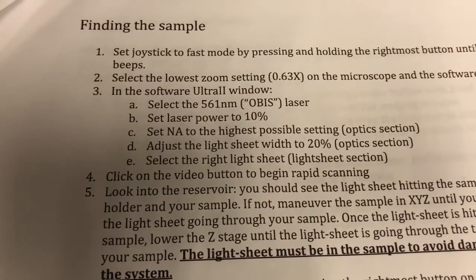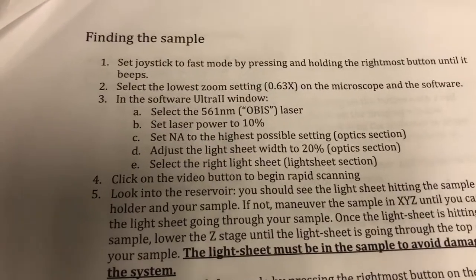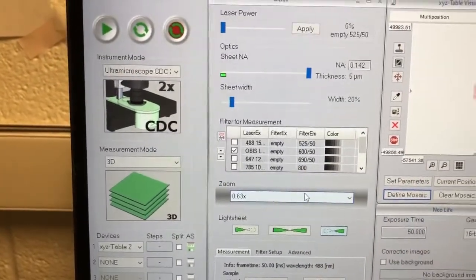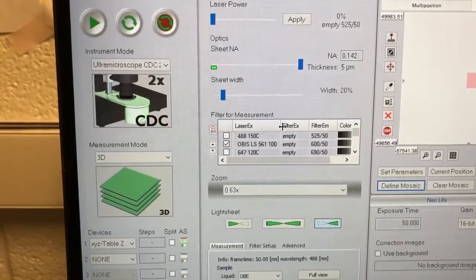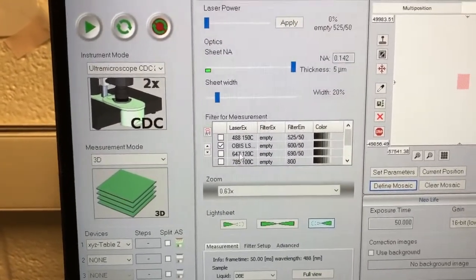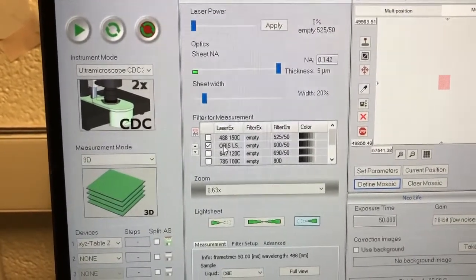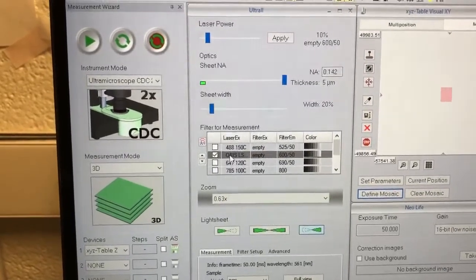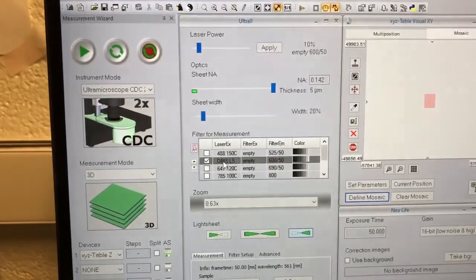Next, in the Ultra 2 software window, we need to select the 561 or OBIS laser. Here's where we select the lasers — by clicking on the name, not on the checkboxes, as the checkbox is for something else. You have to extend the window to see that it's the 561. If you click on the name, that selects the laser, and you'll hear some noises confirming it's selected. It has to be grayed out; if it's not, it won't be on.